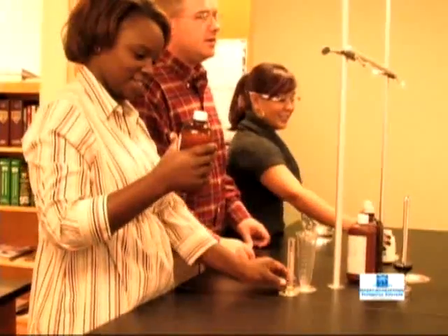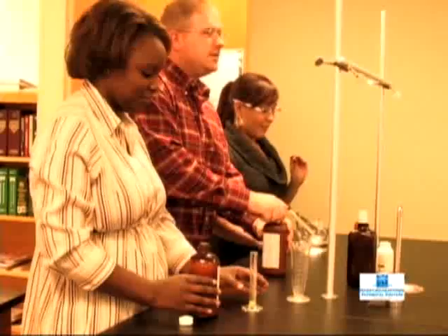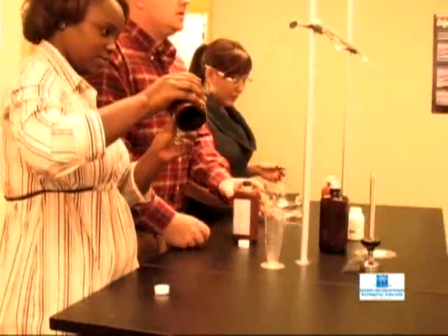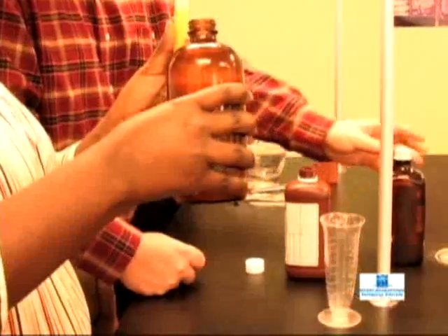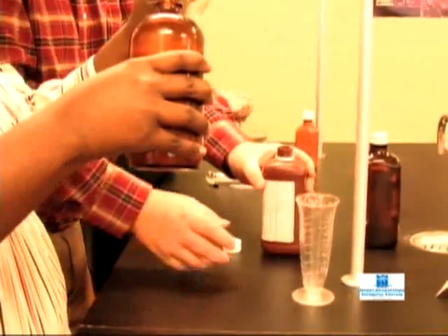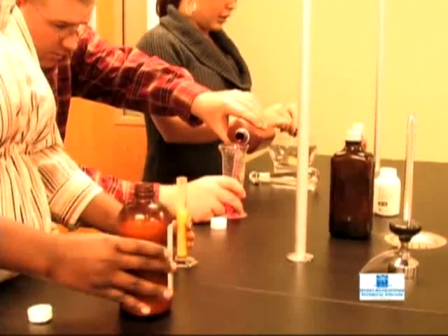Yeah, well, this is your first. You put that in there. So while Christy's getting those ready, somebody can be measuring out. And what was this again? That's the Benadryl. And then this was going to be your solution that you start mixing the tetracycline. 20. Get a little bit out of that. There's a lot, a little bit.